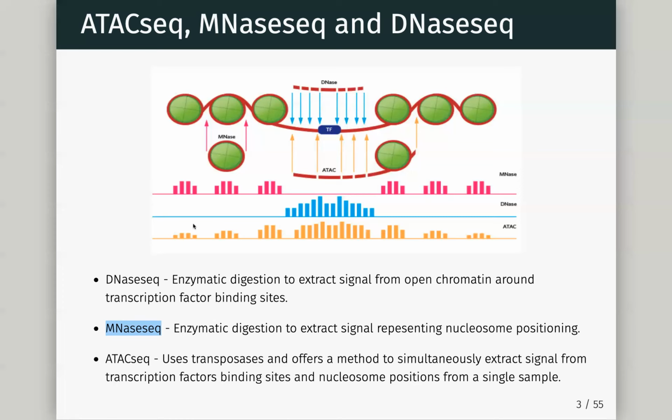So we should be able to, with this, get the position of nucleosomes, maybe, right, from this type of signal, but also get a map of where the open chromatin is, where our transcription factors may be binding. We might even get some signal kind of reflecting the area which was protected because a transcription factor was bound to the DNA. So this is all cutting around areas which aren't covered or protected by other features on the DNA.